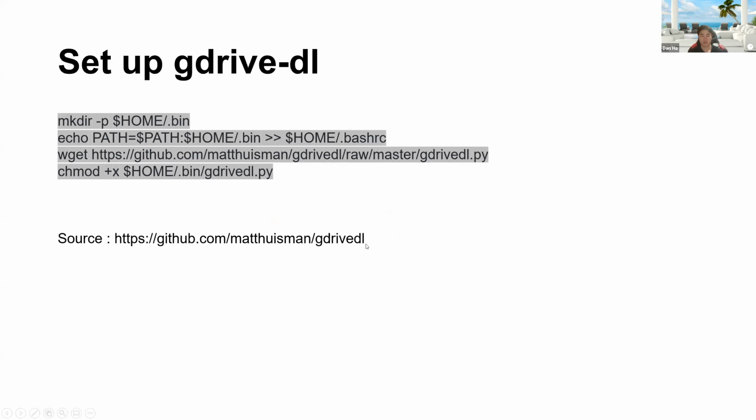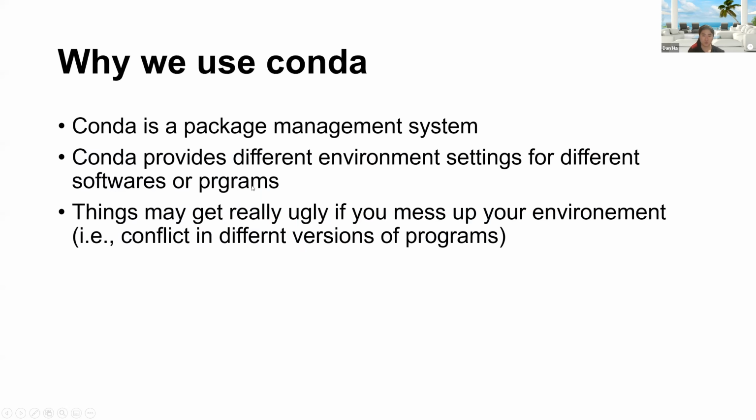I mean, we all suffered through installing this gdrive.dl, right? Once your program is registered on Conda, you don't have to suffer through that. You just need to install Conda and install your software there.